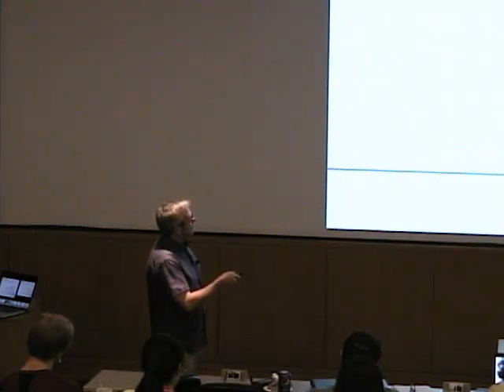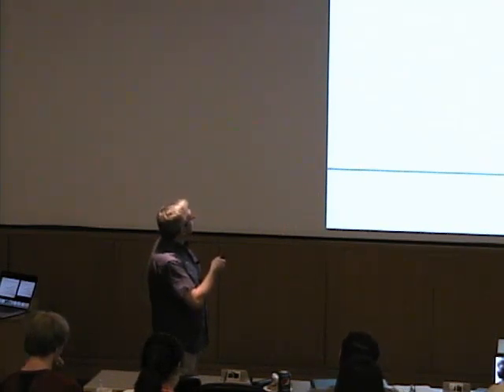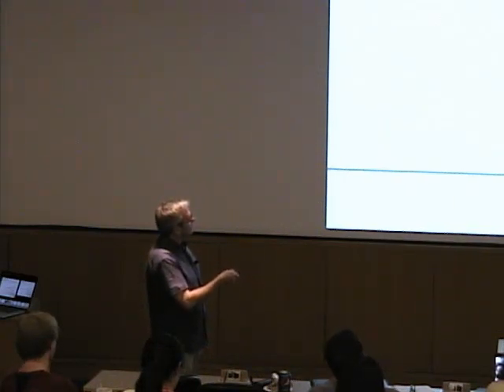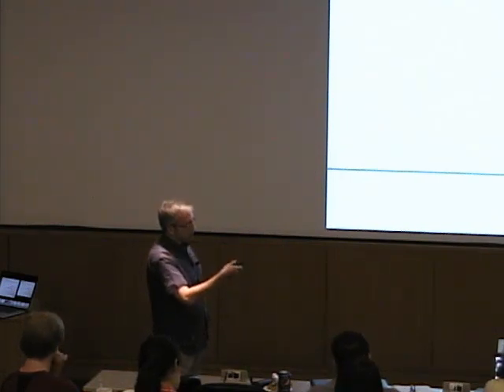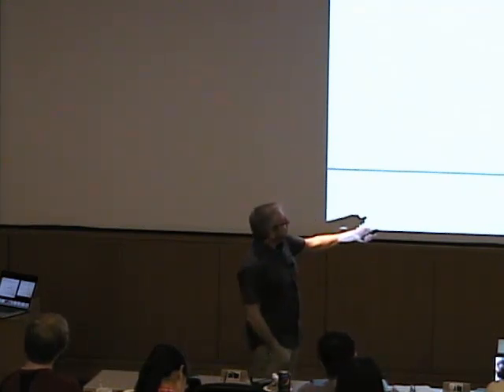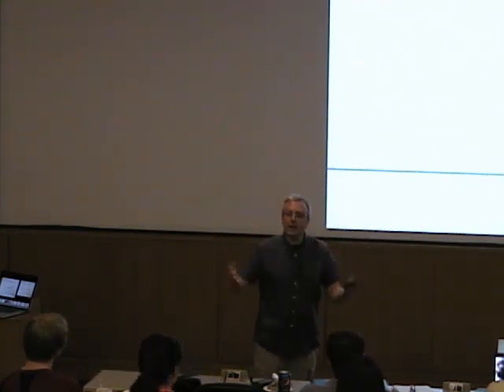So this is basically fulfilling a diffraction condition if Bragg's law is fulfilled, and that is the case if this d star, or d star half actually, over lambda fits in here. And that is always the case if this 1 over lambda is fulfilled. So whatever spot is here on the surface of this sphere, or circle as I draw it, will be in diffraction condition. Well, this is the origin of the reciprocal lattice, which means the whole reciprocal lattice hangs around somewhere.